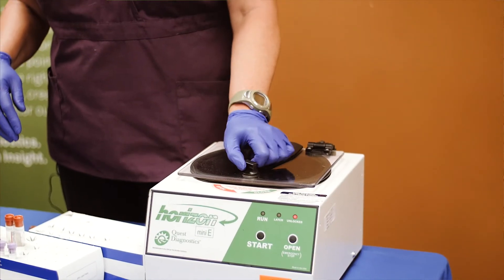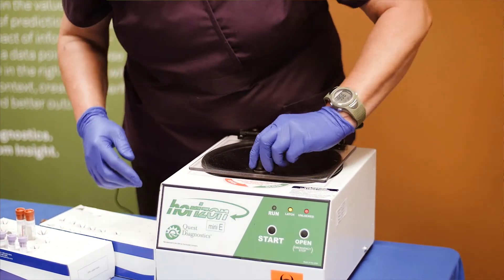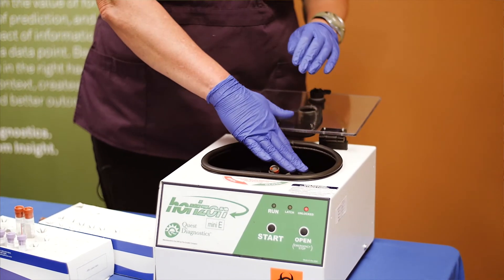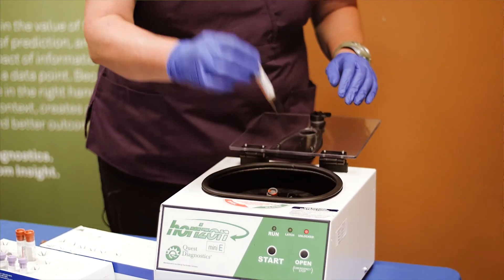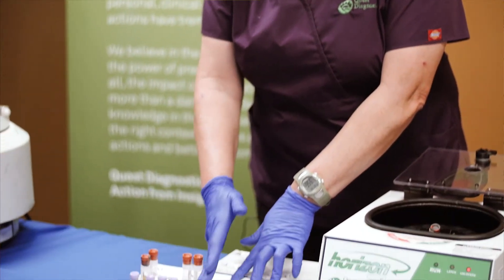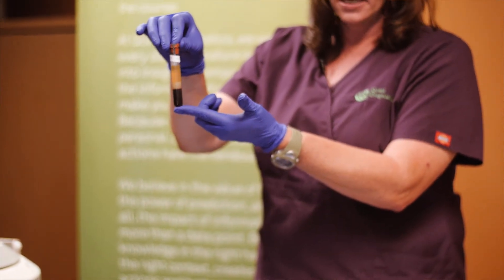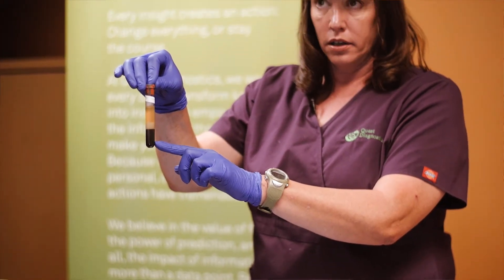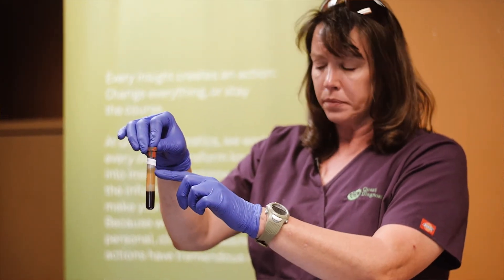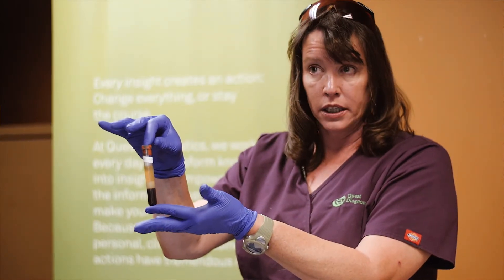Once your centrifuge has completely stopped and you are done, hit the open button which will allow the latch to unlock. You will go back to your starting position — number one — and pull it out, and it should automatically go into your first spot. What we are looking for now is that the sample has been spun: the red blood cells should be on the bottom, our gel in the middle, and our serum on top, because that is what we are wanting to see.